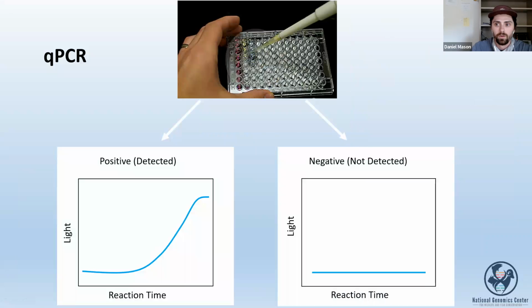So once we have an eDNA sample, we can use what we call an eDNA assay to detect a particular species of interest by isolating and amplifying that species' DNA and only the DNA from that species, not any of the other species that are present in the sample. These assays work using similar technology to another type of assay, which you're probably all pretty familiar with by now, and that is the COVID PCR tests.